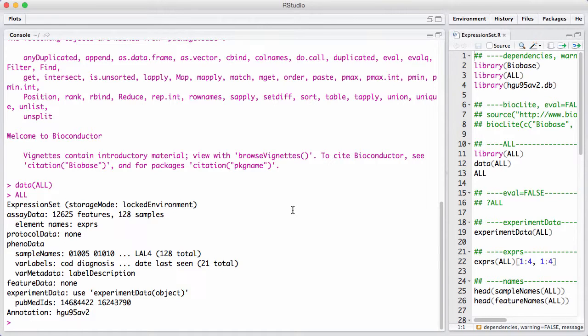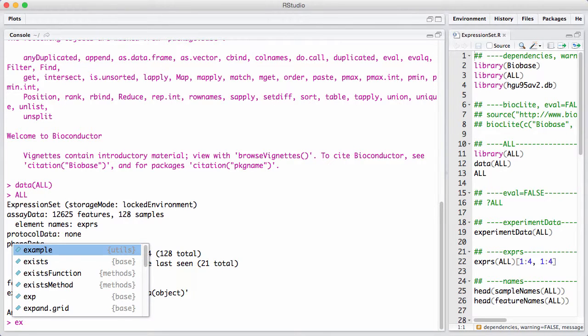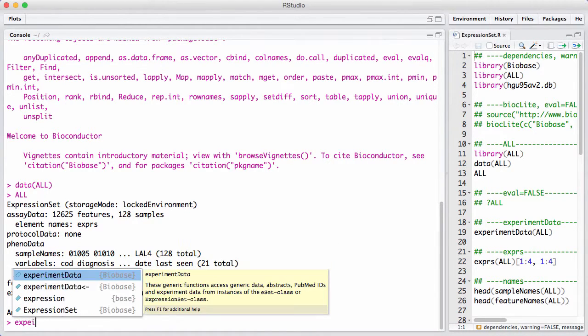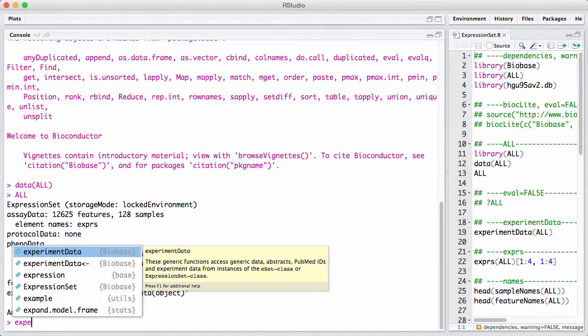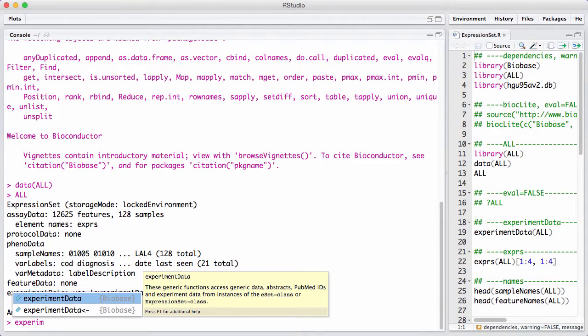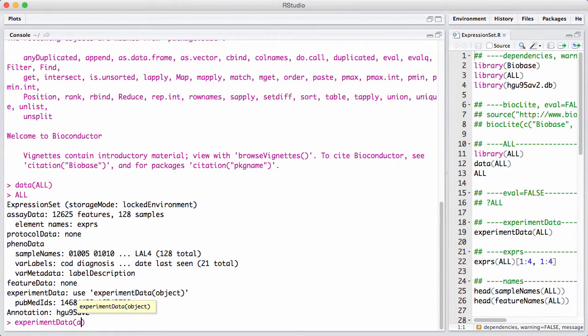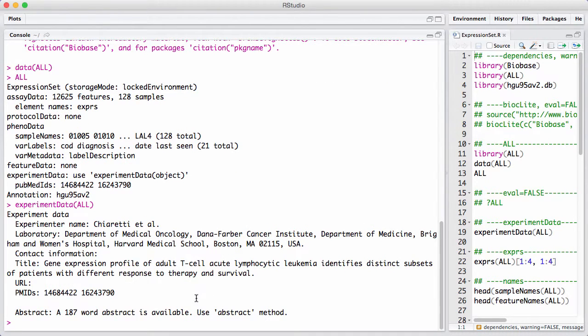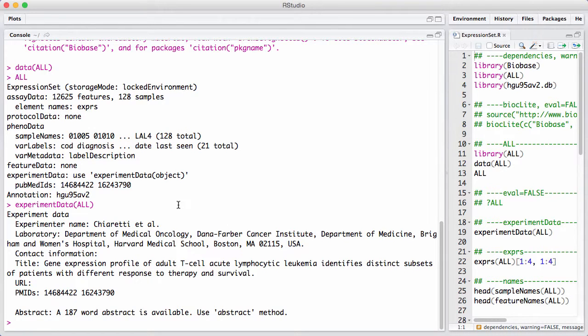We can know a little bit more about the experiment by using the accessor function called experiment data, which prints a little bit of information about who did the experiment and what was the title. And there's links to two PubMed IDs, two specific papers detailing the experiment.